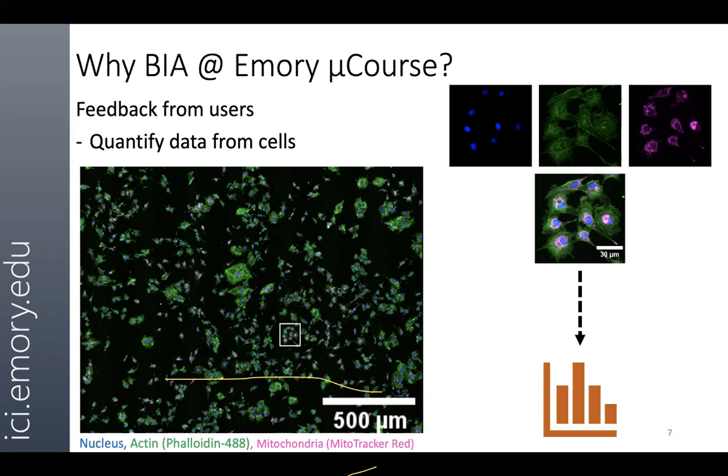At the end of the day, everything starts with the question you are trying to address. Once you know that, we can build on top of it, in terms of planning the experiment, using a particular microscope and microscopy method, and thinking about the image analysis right from the get-go.